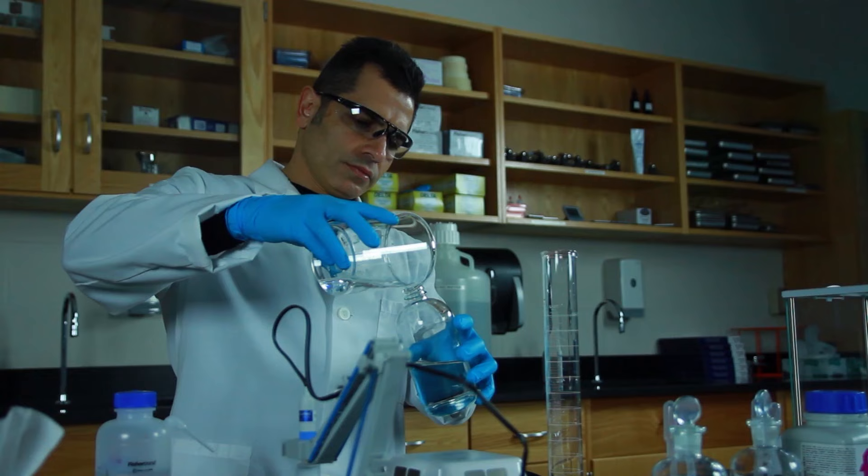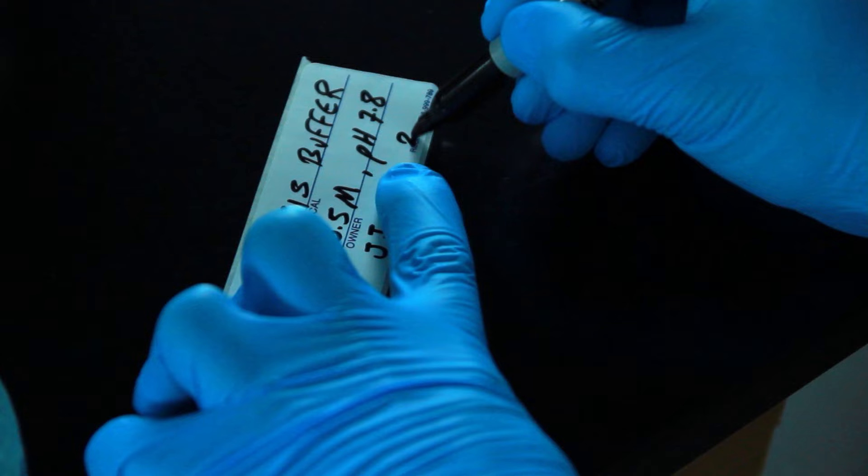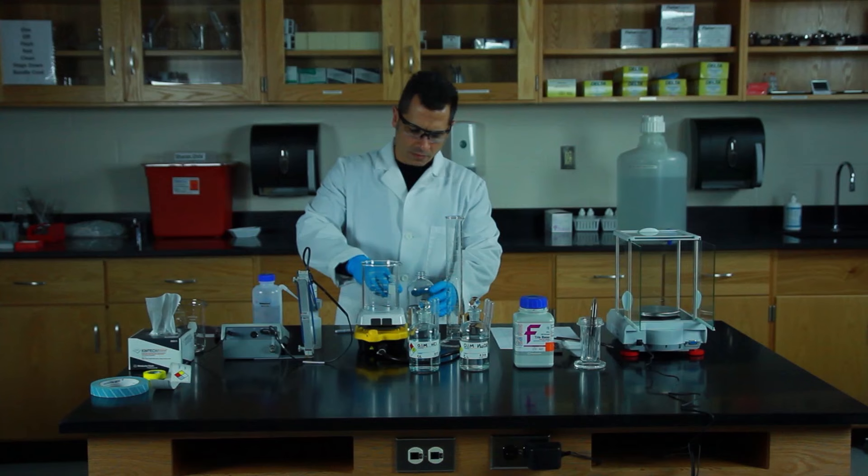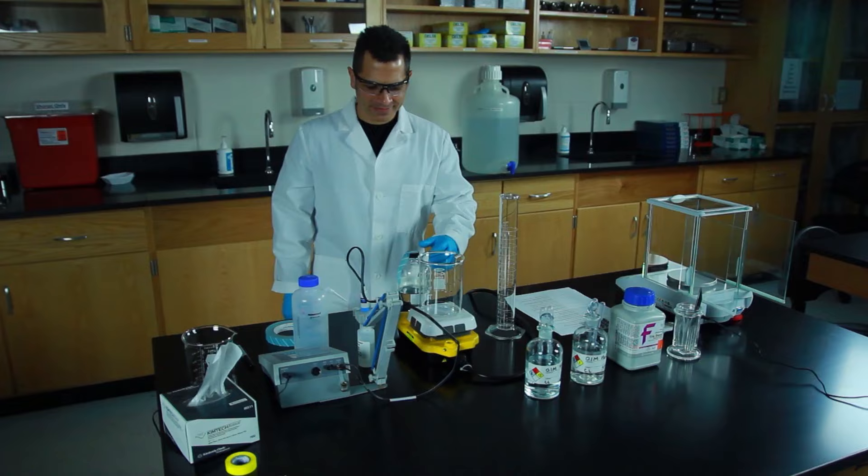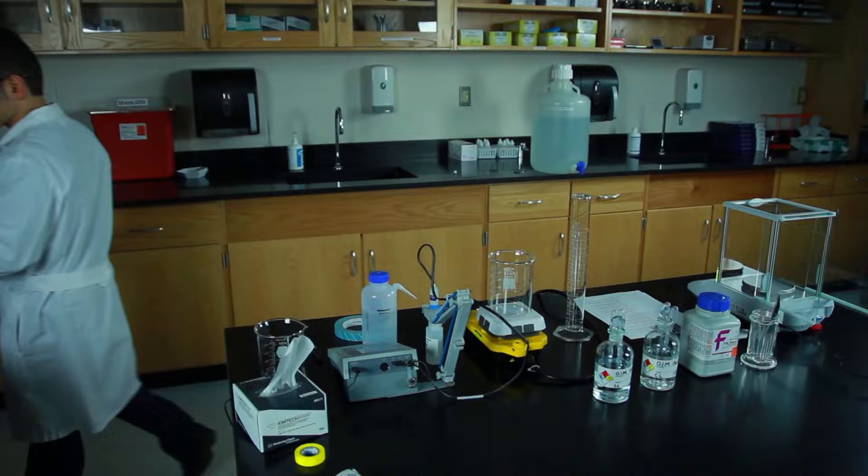Pour the buffer into a bottle and label it with the name of the solution, the pH, the date it was prepared, and your initials. Now our Tris buffer is ready to be sterilized in the autoclave.